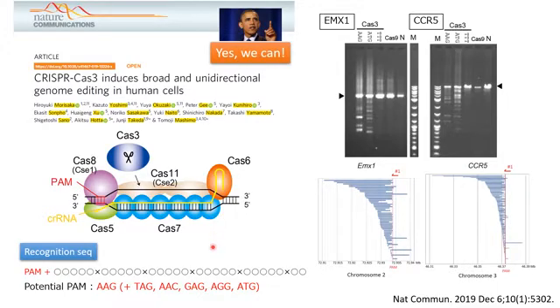There are several different features between the Cas9 and Cas3 systems for genome editing. As you can see here, CRISPR-Cas3 induces large deletions upstream of the target sequences. The deletion size ranges from several hundred to a thousand base pairs; you can see the degraded PCR band on the agarose gel here. And you can also see several hundred to thousand base pair deletion bars here upstream of the target site, as shown in the red line. Therefore, Cas3 is more applicable to deleting large regions or knocking out a full genomic region. On the other hand, Cas9 is generally used for generating small indel mutations.